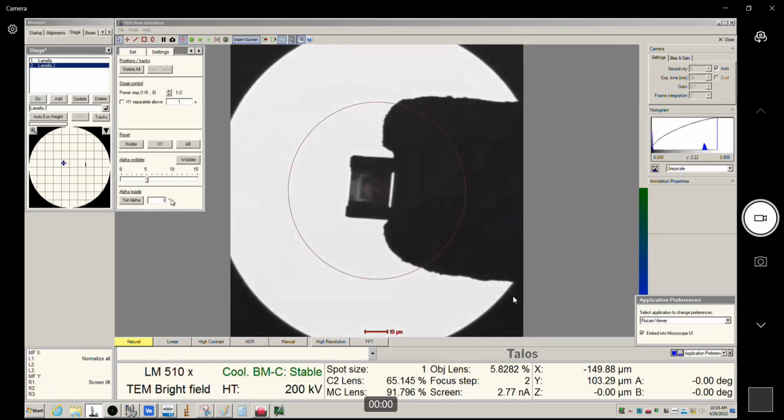The way that we set it normally is by being in SA mode, and then we push eucentric focus, and then we adjust the height to get the image in focus. But what we're doing in that instance is putting the objective lens at a specific preset value that corresponds to where the image would be in focus if the sample is at the right height. So to actually find eucentric rigorously, we have to wobble the alpha tilt.